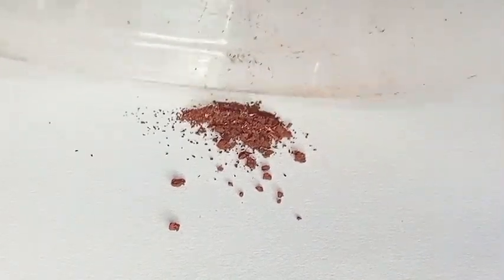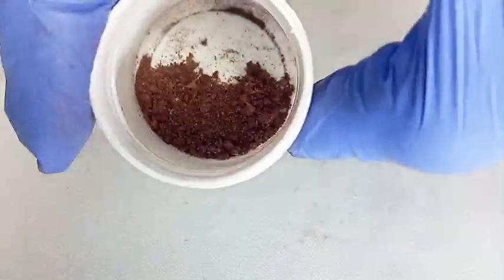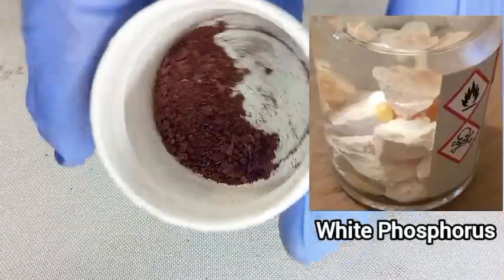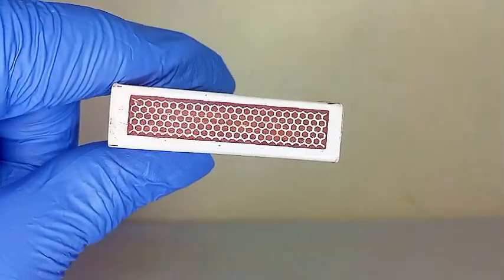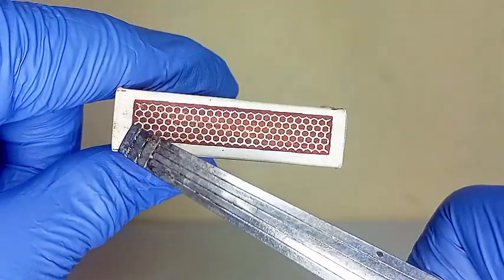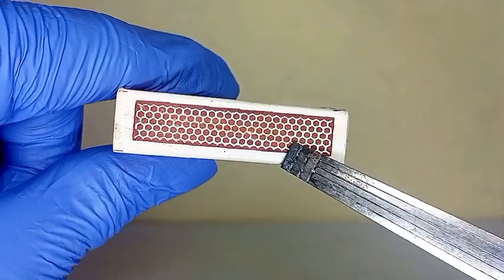Red phosphorus is one of the several allotropes of phosphorus. It is relatively stable and safe to handle, unlike its cousin white phosphorus. Its stability makes it the key ingredient on the side of matchboxes, and for the average chemist, that striker pad is the most accessible source of phosphorus.